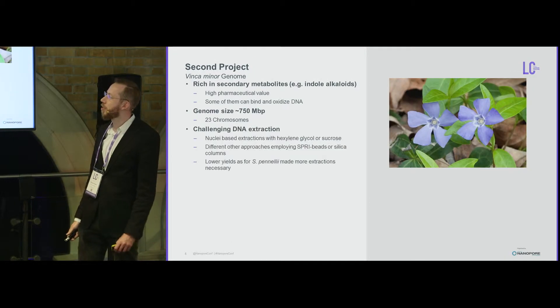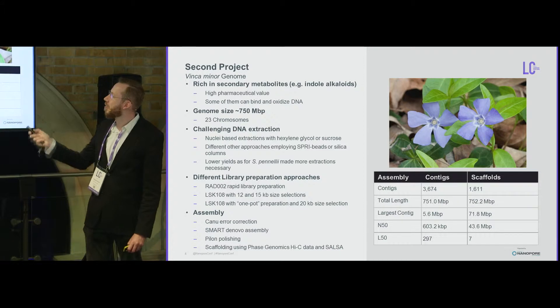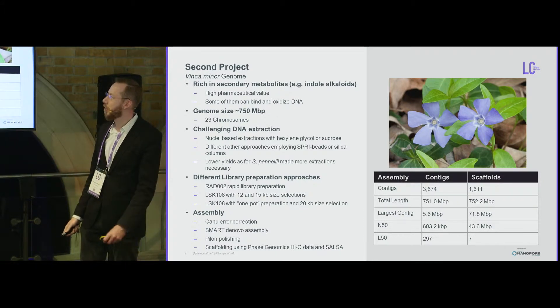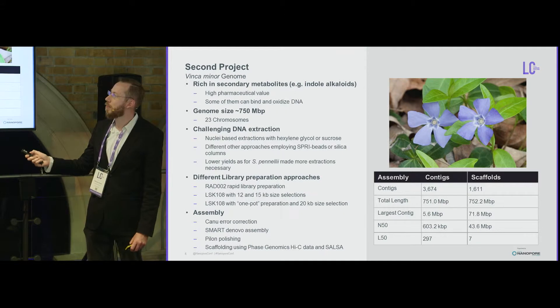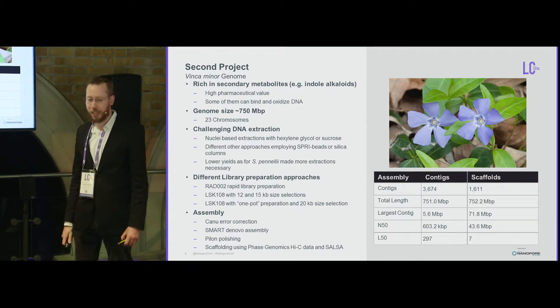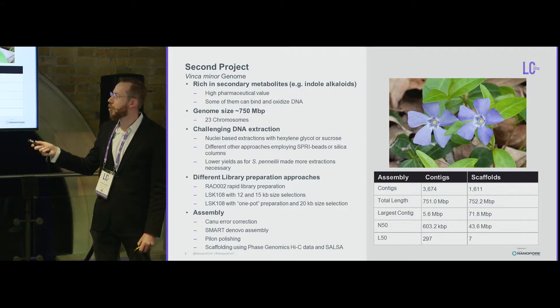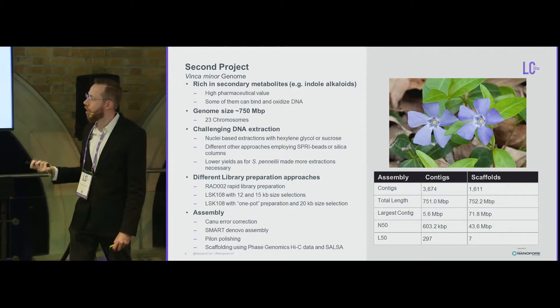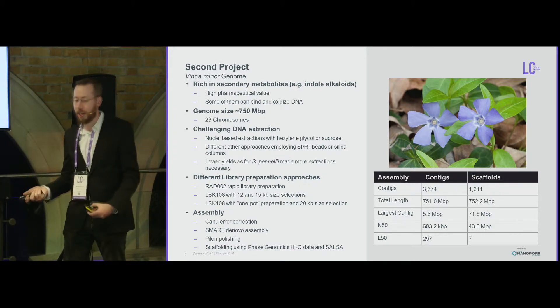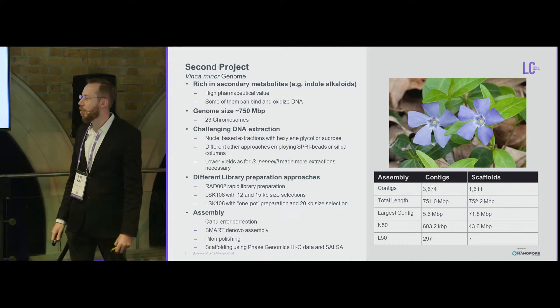After that success we moved on to something more challenging: Vinca minor, a perennial species containing pharmaceutically interesting secondary metabolites. The problem is these metabolites can bind to and oxidize your DNA, so we often had very low yield or just a small brown pellet. We tried SPRI beads, silica columns, but none worked well. What worked best was a nuclear-based extraction — not with hexylene glycol, which didn't work — but with sucrose, spermidine, and spermine, which kept the Vinca nuclei better intact.